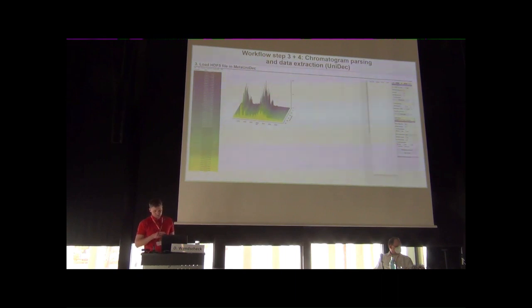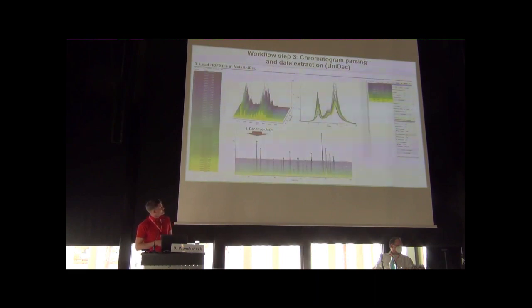After you select your needed parameters, you then hit the Run All button here at the top, and you will receive the deconvoluted spectra over time and the identified species with the intensity. The peak integration will then take place at the data export in a CSV file, and the CSV file can then be handed over to the kinetic modeling.